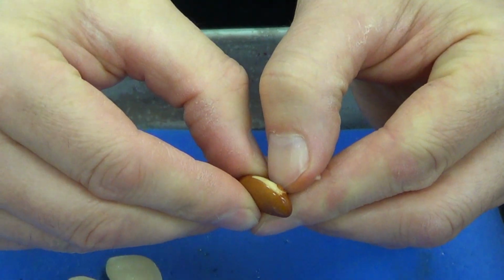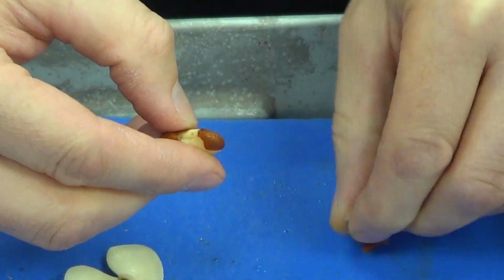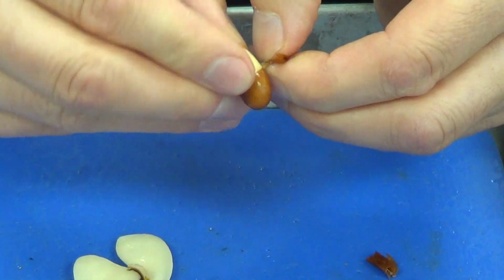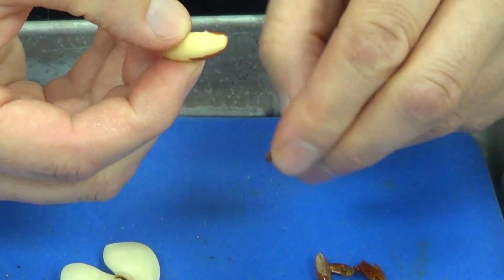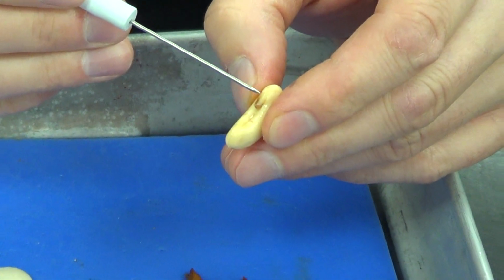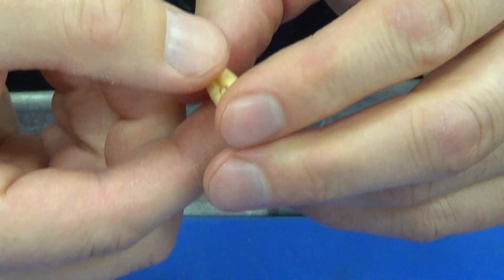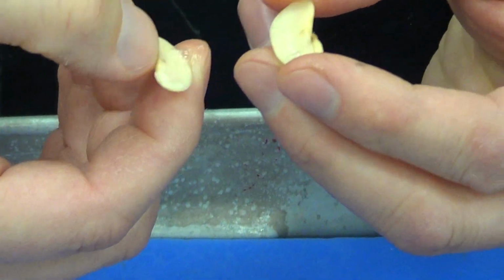As you can see, I'm starting to peel it away ever so gently. I'm going to peel that away. That's all the seed coat. I'm taking care not to squeeze it or pinch it too hard. I don't want to damage the embryo. You can see the embryo sticking out right there just a little bit. Now I'm going to give it just a little pinch so I can pull this apart. There we go. It should just break in two automatically because it is a dicot seed.